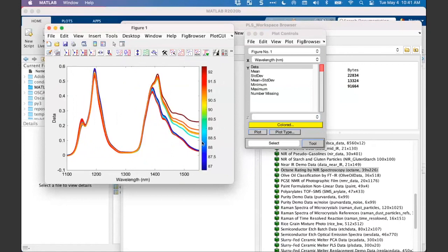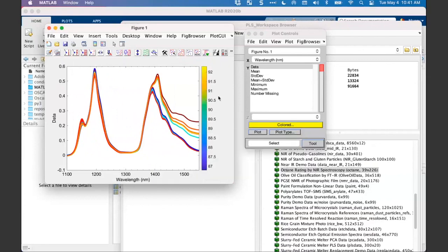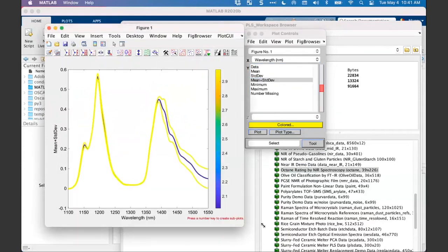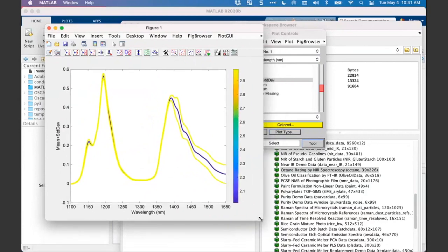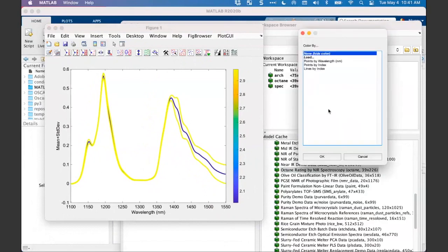One last tool that I wanted to show you is, and I'm going to change this back to... Hey, Manny. Yes, I did have a request here for showing just the mean plus standard deviation in the plot. Yes, and so you can show that. Not my favorite color scheme for that. If you get rid of the color bar, you'd get the usual colors, I think.